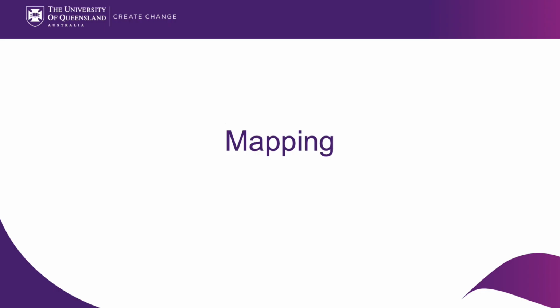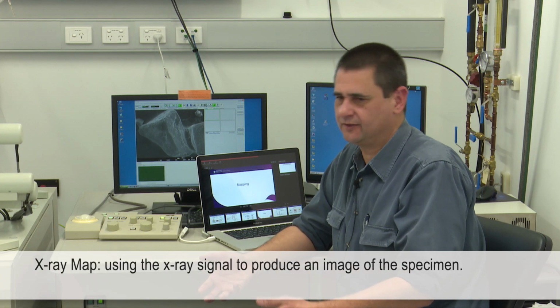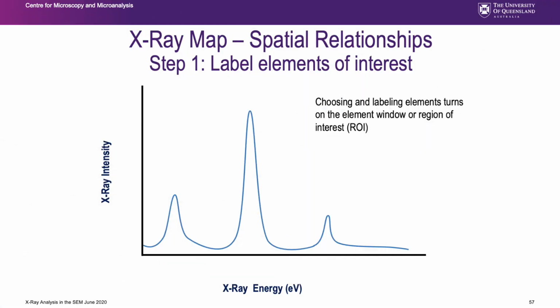I'd like to talk to you about X-ray mapping. An X-ray map is producing an image of the specimen, not using the electron signal, but using the X-ray signal. We all know that we can produce an X-ray spectrum, and each one of those peaks, in general the major peaks, corresponds to a major element of interest.